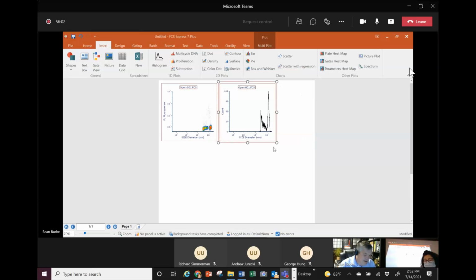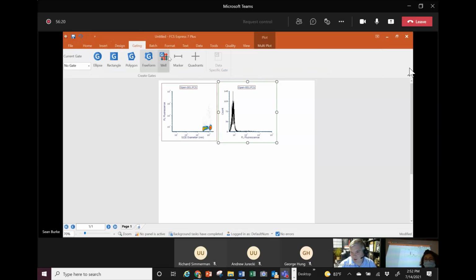And in this experiment, again, this is a live dead staining. And if I change to my fluorescent parameter, which is the amount of propidium iodide that's been either incorporated or not incorporated into the cell, I can visualize what's going on. And when I talked about gates, the way that we handle gates, what we call markers on histograms, is we can just draw a little marker.